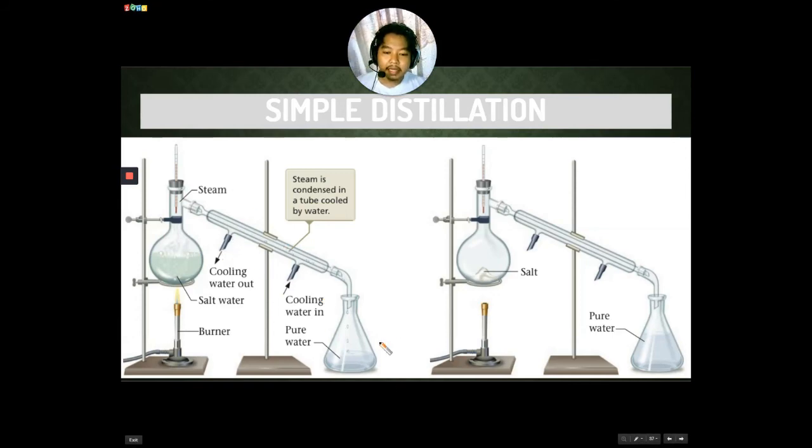And I'll be collecting here my ethyl alcohol, and what would remain before it reaches 100 degrees Celsius is my water. So this is not the pure water. Iba atang example dito. So dito, ito yung salt, pure water. So ito yung sinasabi ko kanina, if we simply want the salt, there's no need for this distillation setup. We simply evaporate the water and bring it to the environment, diyan na siya sa langit pang dagdag sa ulan. But if we want to collect once again the water, we will use a distillation setup.